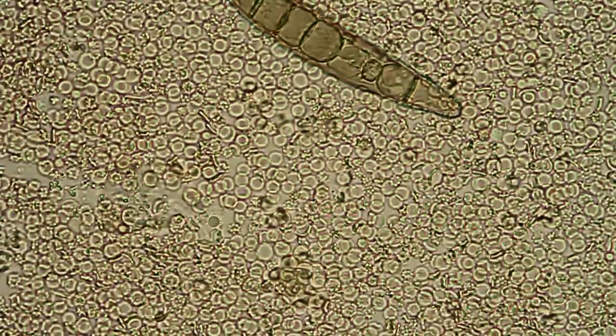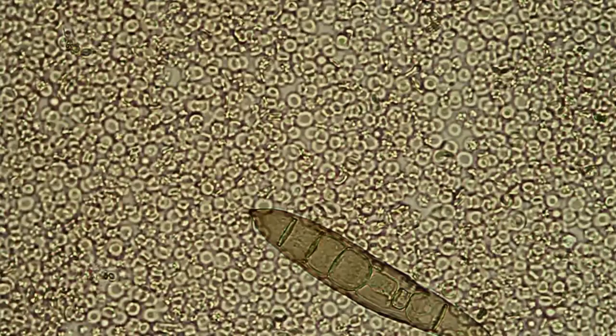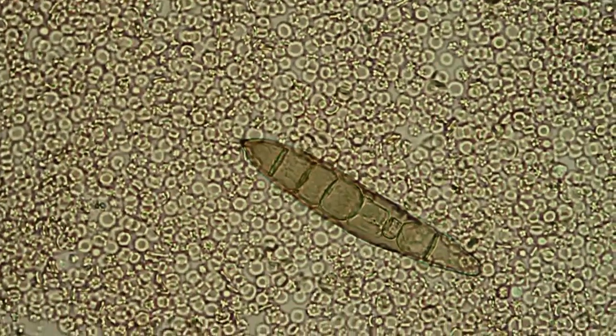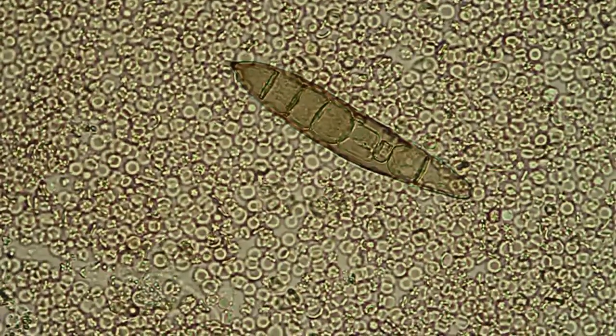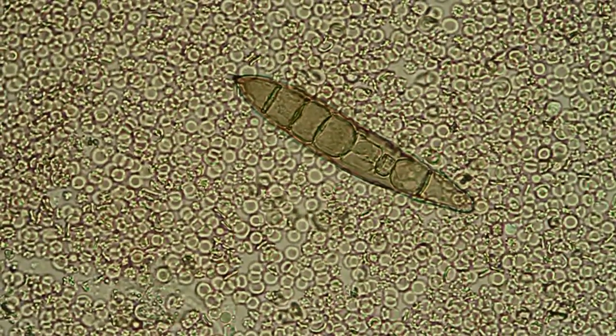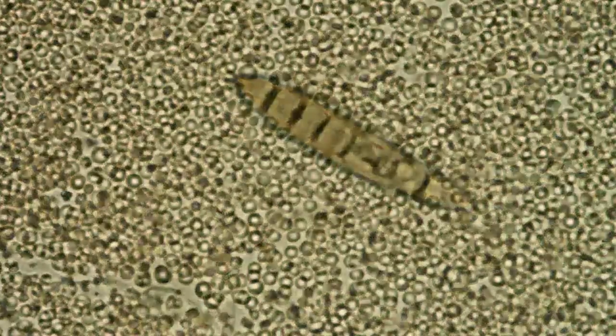Let's see what this thing is, focus in here, there he is. Yeah see I've seen these things in my water samples so maybe the slide got contaminated or the cover slip, or I'll bet it came off the pipette as I used one that I've used before for water.